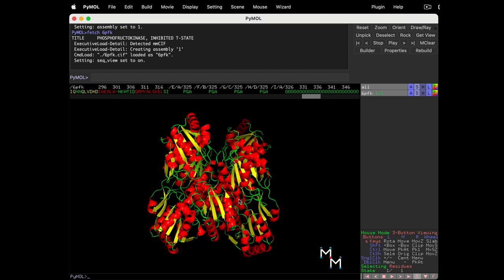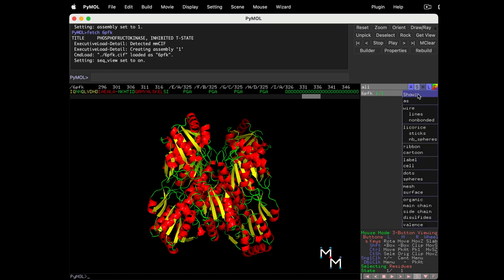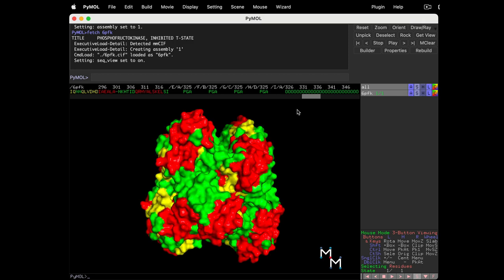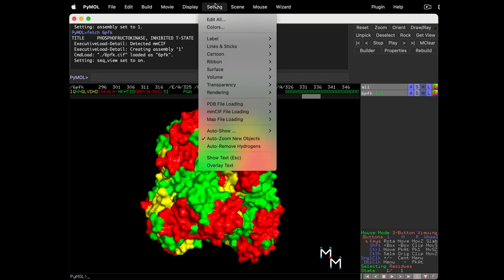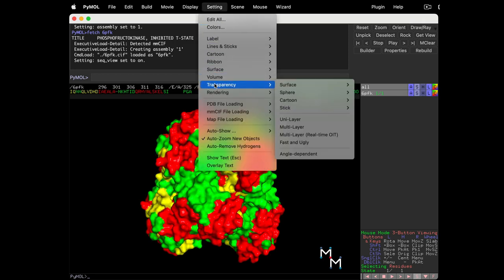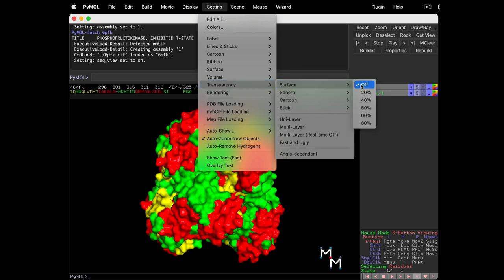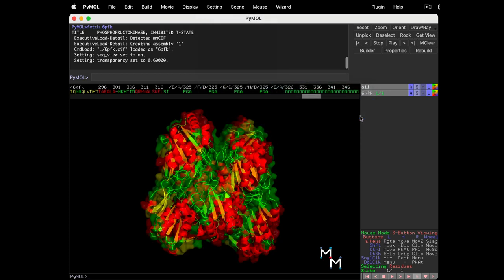What if we want to show both the secondary structure and the protein surface? We can make the surface semi-transparent to achieve this. Add the surface back using the show button. Now, use the drop-down setting menu. Find transparency, surface, and let's go with 60%.